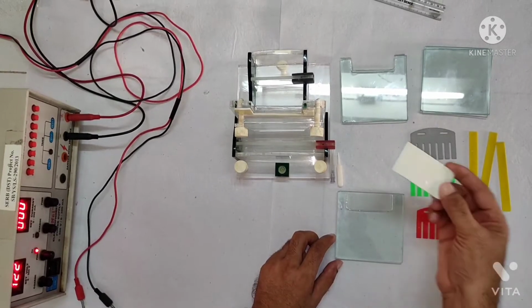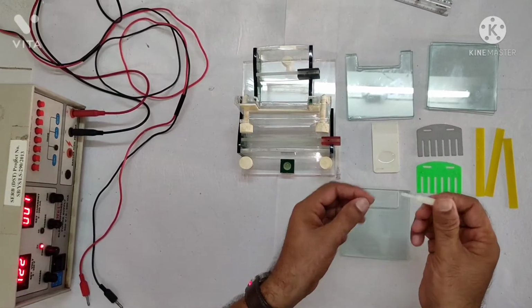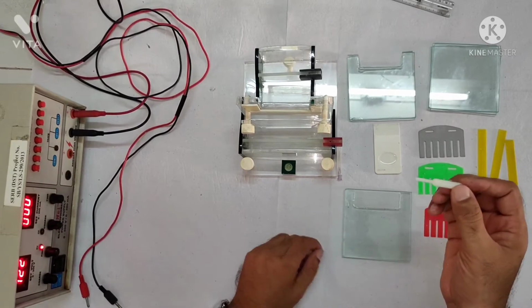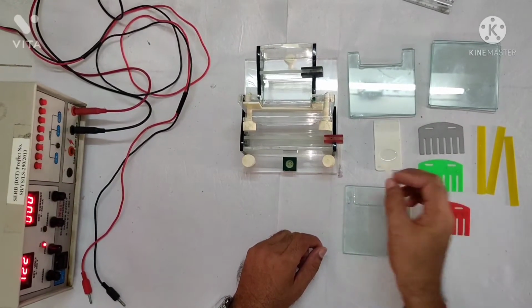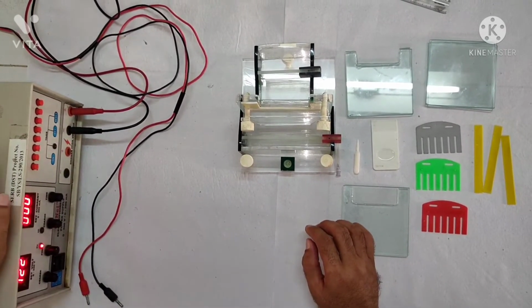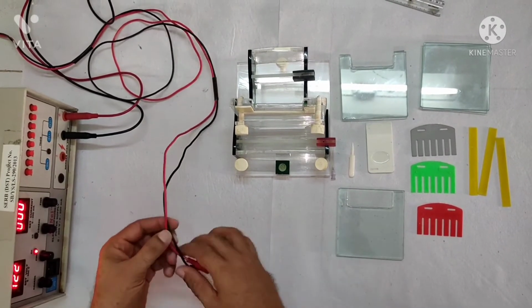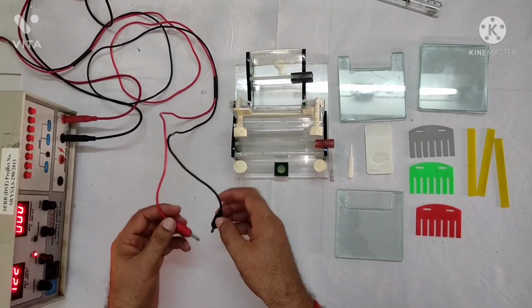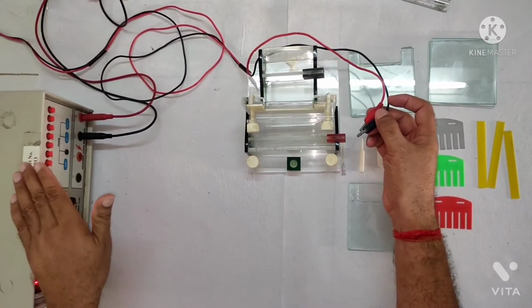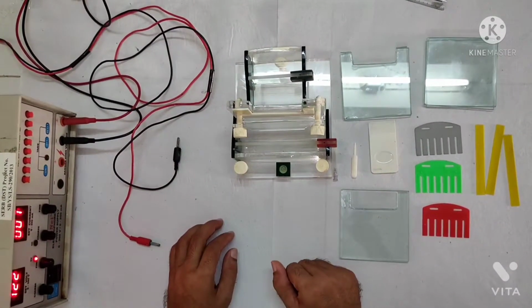This is the spatula by which we remove the gel after running, and this is a small device by which you can clean the wells. If some stuck acrylamide is there, you can clean it with this apparatus. This is the power pack, as we mentioned in the earlier video. The same power pack can be used here, and this is the cord by which you can run the gel. You pass the DC current, so this device will convert the AC current into DC current. So positive and negative electrodes are there, so you can fit them here and run the gel.